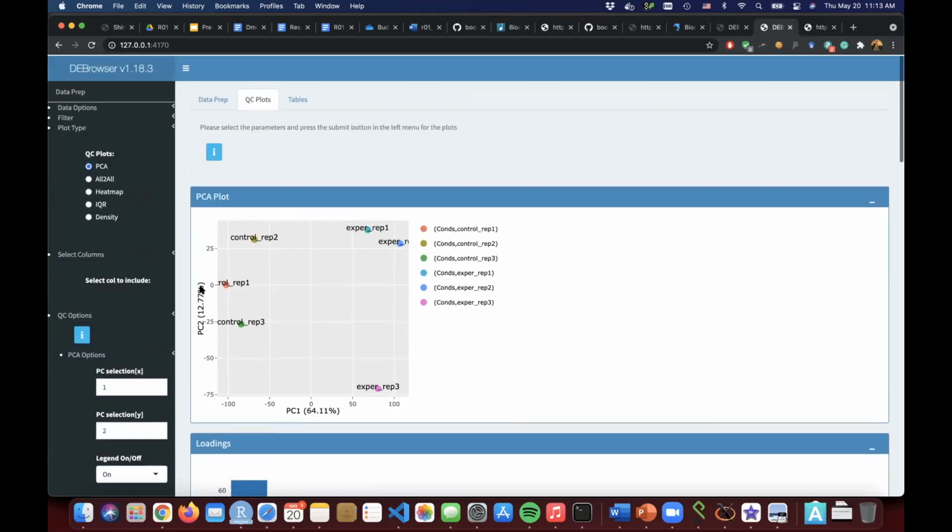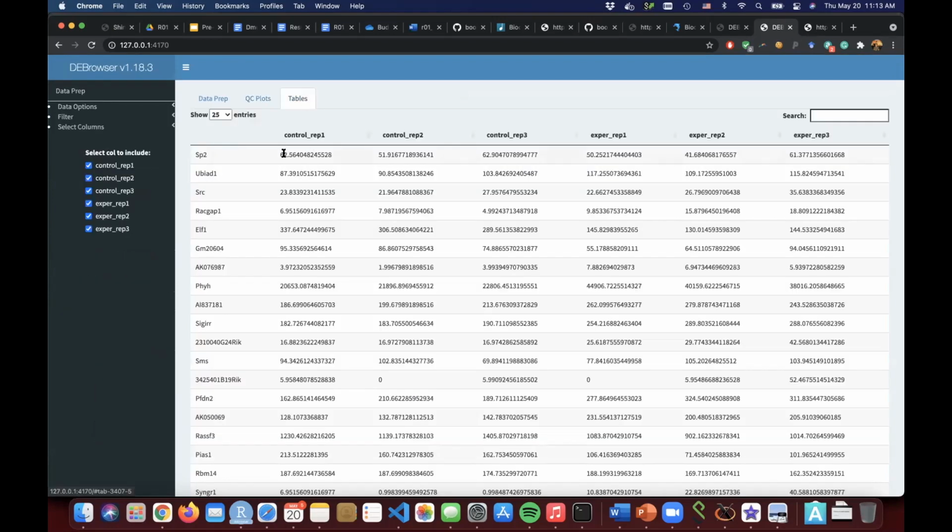When I say variance, it means the variation between all these samples, so for example, the variation can be in the condition or in all samples here. It's basically an unbiased way of variance calculation. And I will show you what the variance means in the box plots too. But basically it's the variation in the conditions and in all samples.